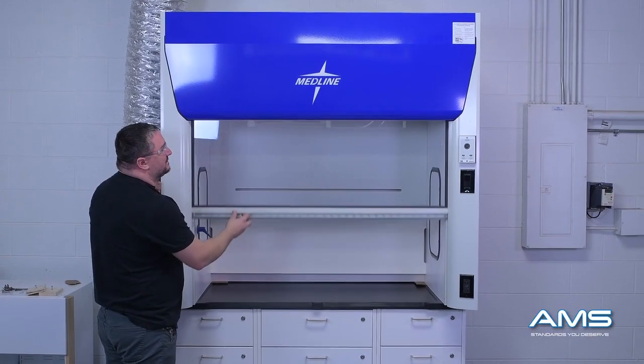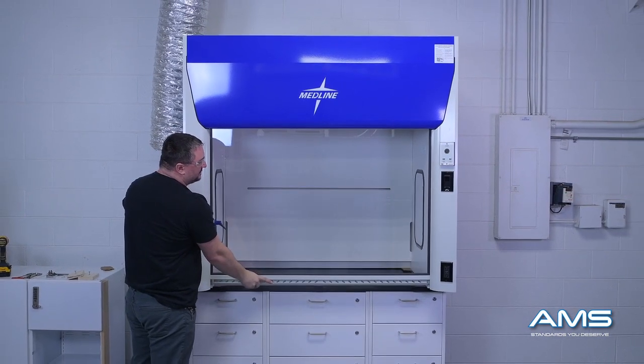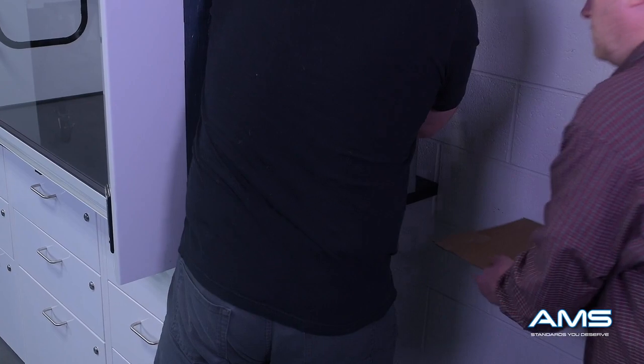With the hood on the countertop, check the sash one more time to be sure that lifting and moving it didn't adjust anything — everything should still be in good position. Remove the cardboard: have one person apply slight upward pressure while the other person pulls out the cardboard.